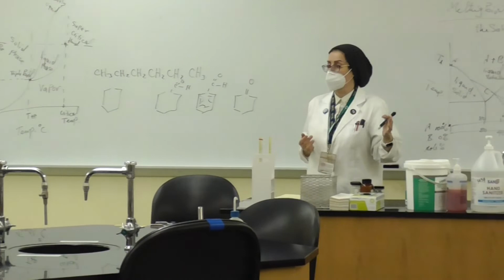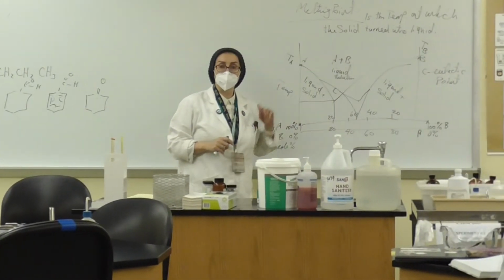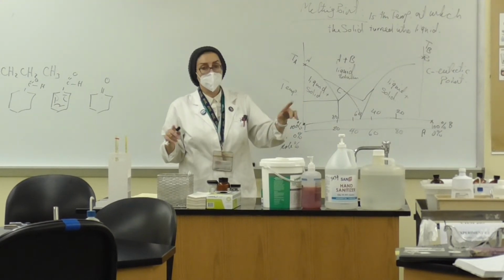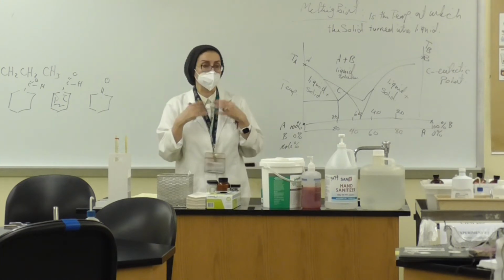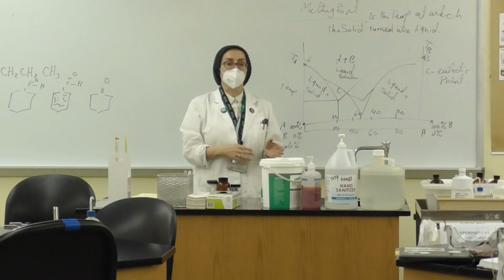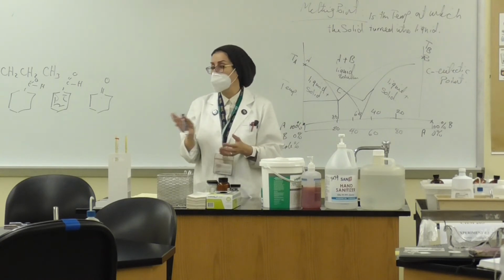We will be able to return to the reference, and we will be able to find how many percent went down, or how the range changed. So that's another study to help us know whether our chemicals are pure or whether they are contaminated. And it happens, by the way, it happens.